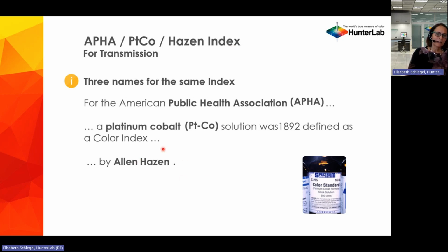Especially the last name is often confusing our customers because we also have another Haze index, and that's for turbidity. You really have to keep in mind, Hazen is not the same as Haze. It's something completely different.